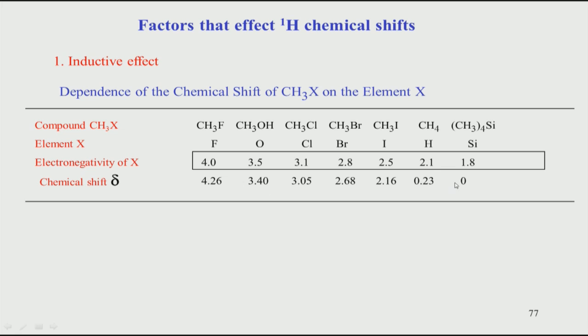So, chemical shifts are calculated based on this idea. You can choose any other molecule as 0, but there are different reasons why we choose this particular compound as a reference. We will see that again in later classes. One of the reasons is that it is a very inert compound. It will not interact with the compound in your sample. Secondly, it is independent of many conditions such as temperature and pH. There is of course slight variation, but those variations are very minor compared to what happens in your molecule. Also it has a very strong signal. It has 3 times 4, 12 hydrogens, because all the CH3 groups are equivalent. We will look at equivalence later.